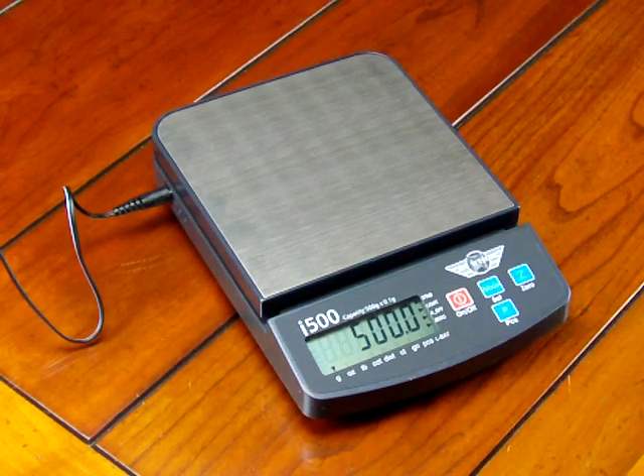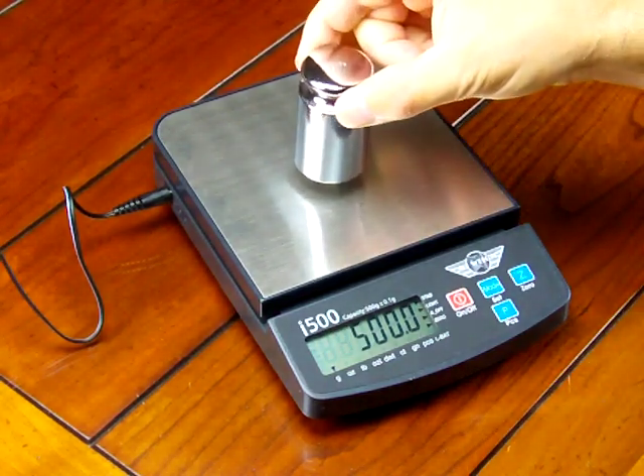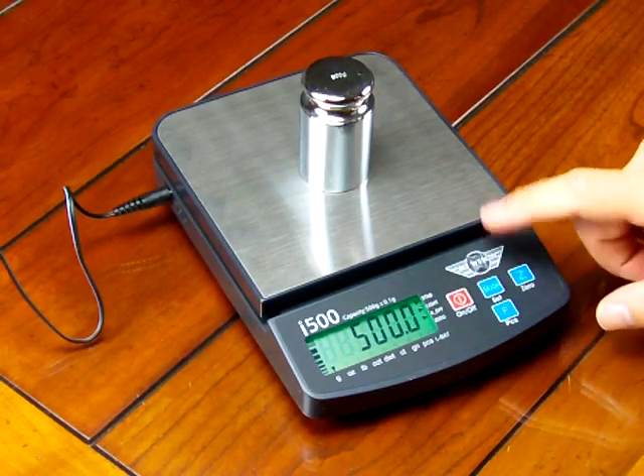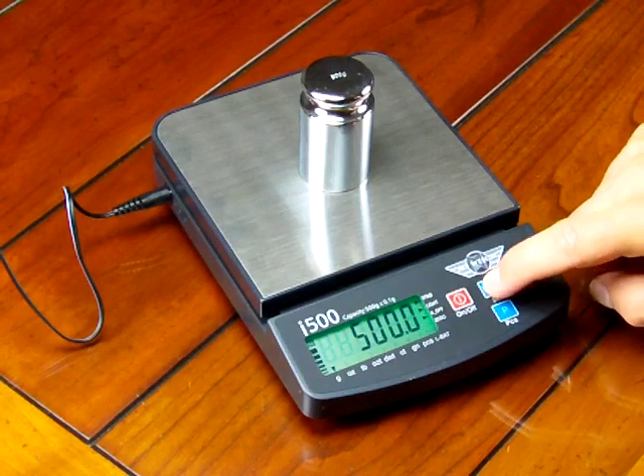Now it's showing that we need a 500 gram calibration weight. The i500 does not come with a CalMass — this is an optional accessory, and we highly recommend you buy the weight so that you can perform calibration. So I have a 500 gram weight and we're going to put it on the center of the platform. The next step in calibration is, once again, we're going to press the set mode key — press it once.